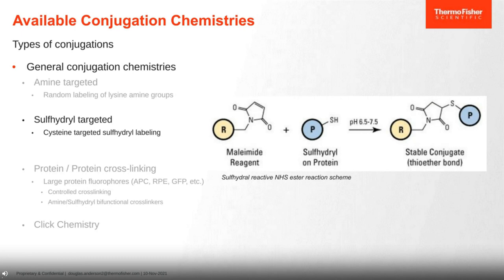So these sulfhydryl chemistries are also very easy to do at the bench. Quick reaction times, well characterized. These chemistries have been around for a long time. So they also have a very nice, easy workflow of a single one-shot reaction followed by purification. So another good classic choice to put a label on a biomolecule.